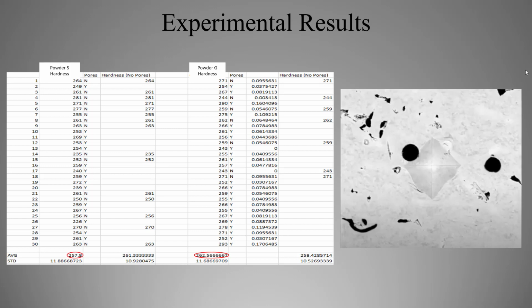Using the Vickers hardness calculator, an average of the two lengths is calculated, called the Vickers hardness value. These values don't have any unit as such. Hardness is resistance to plastic deformation. If the hardness value is higher, that means that particular spot did not deform as much. On the other hand, if it is a lower value, then that spot was more deformed than the others.